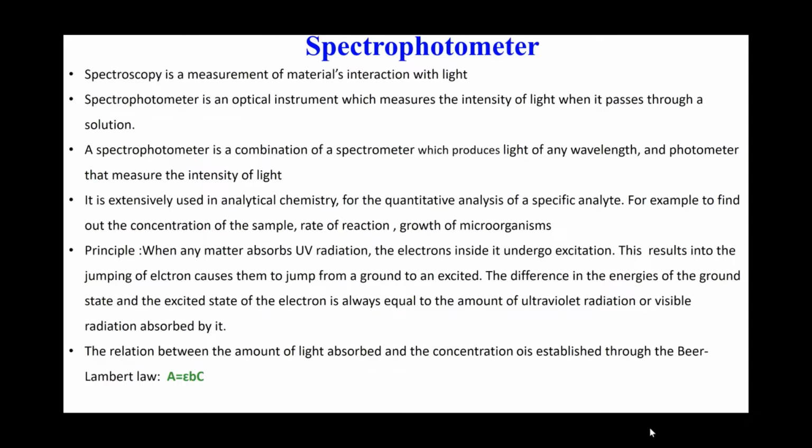Hello everyone. Today we will be looking at the demonstration and tutorial video of spectrophotometer. Spectroscopy is a commonly utilized study that quantifies the interaction between the light and the sample of interest. Spectrophotometer is a device that measures the intensity of light as a beam of light passes through the sample solution.